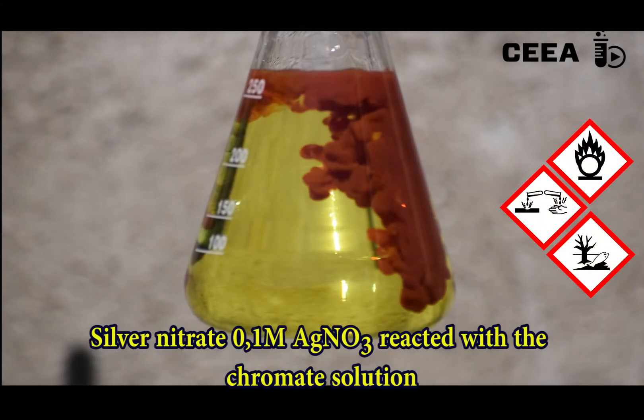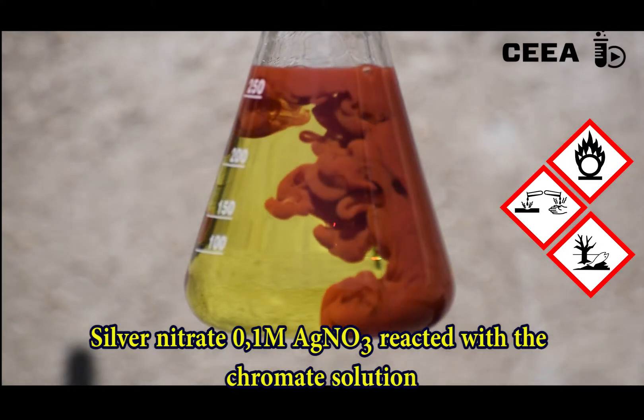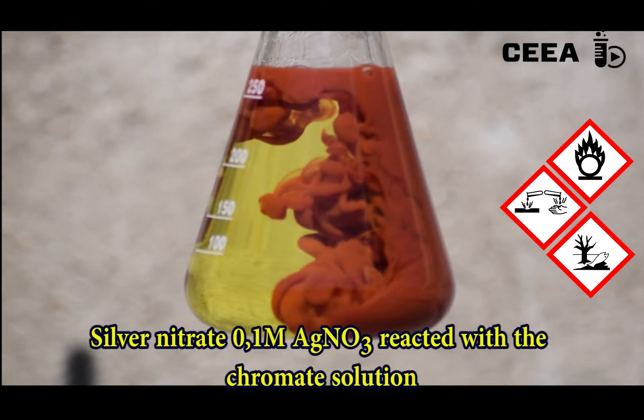Observe the abundant bright red precipitate formed when the two reagents are mixed.